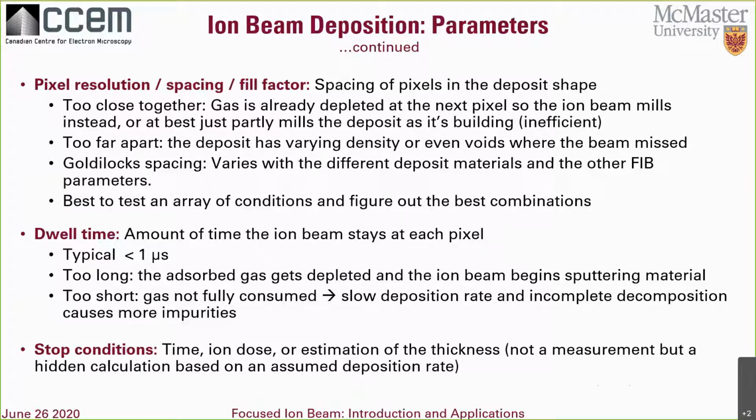So the right thickness, well, you could base it off the depth of the amorphization and gallium implantation, and those are material dependent.